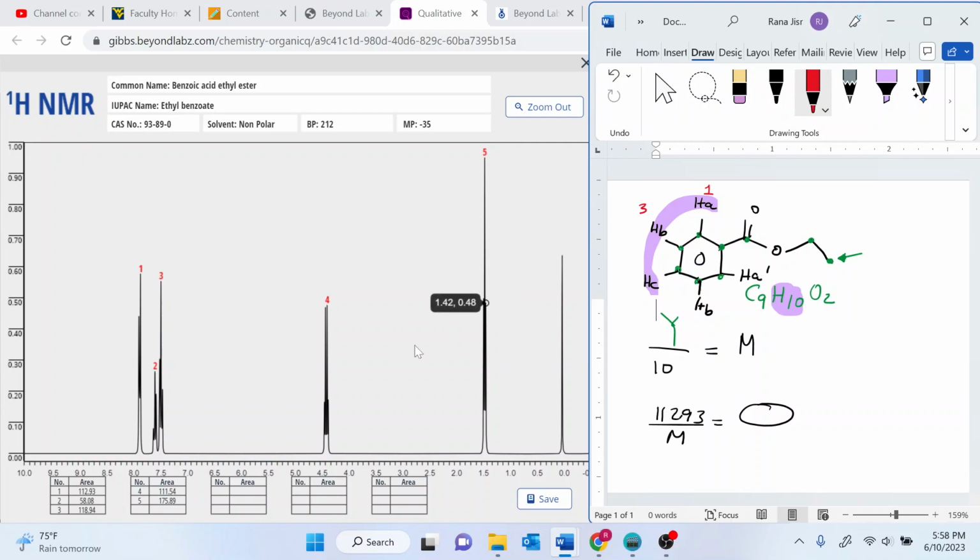And then proton C, it's going to be 1 hydrogen, and this is going to be signal number 2. You go with the number of hydrogens in there, you can easily see that signal number 1 is the same intensity as the 3, so these two contain the same number of hydrogens, and signal number 2 is half the number of hydrogens of 1 and the 3.